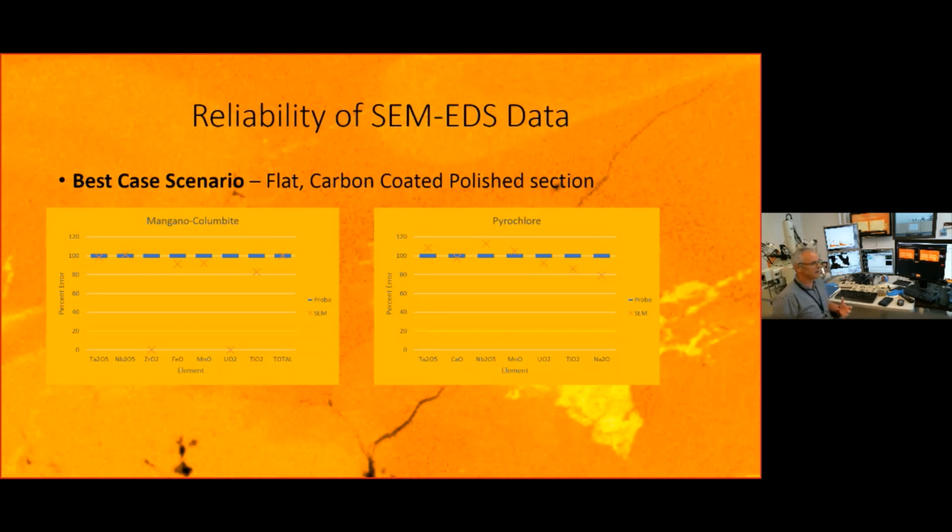Okay, and I had an opportunity just this week because I'm working on a project from the museum collection. A couple of years ago, one of our students, Ian Beats, sampled all the tantalite-columbite minerals in the collection, because most of them are just labeled as tantalite-columbite. And to properly name them, you need chemical analysis. So he sampled all of those, mounted them up in epoxy blocks and polished them for me. And so for the past 3 weeks, I've been analyzing these things and finally getting names for some of these materials in the collection. I'll get you the data later, Erica.